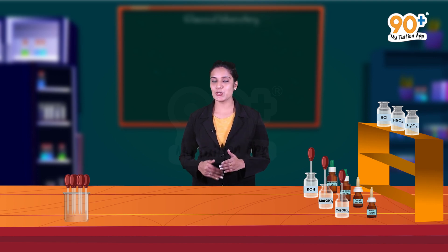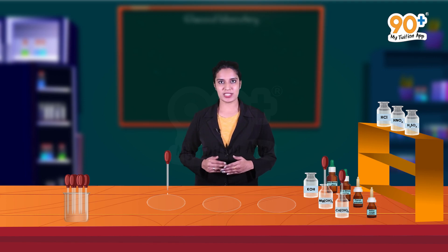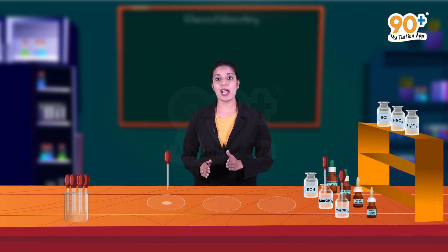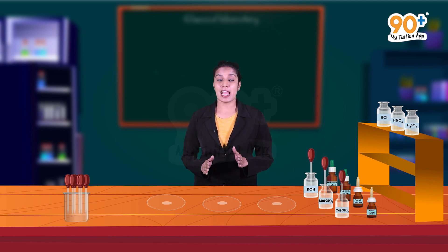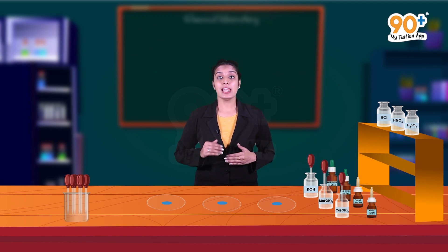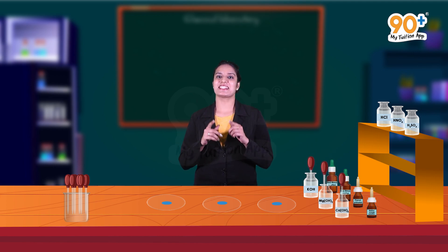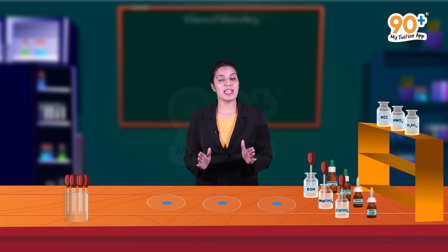Now let's have a look at another set of solutions. Here, we are taking three watch glasses. I am going to add one drop of potassium hydroxide to the first watch glass, one drop of magnesium hydroxide to the second, and one drop of calcium hydroxide to the third watch glass. Now let's add one drop of red litmus solution to all of these. You can see that the red color of the solution changes to blue. It indicates that these solutions are basic in nature.